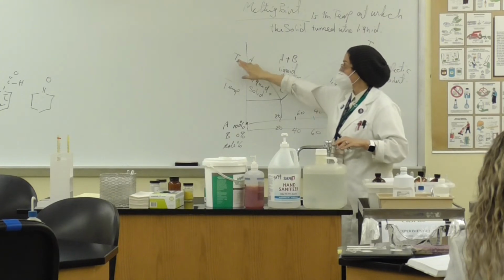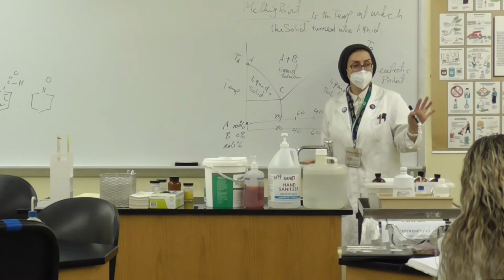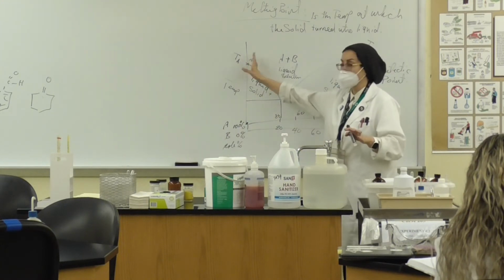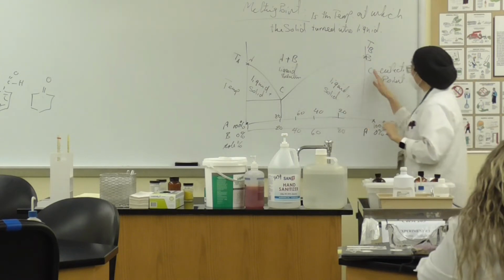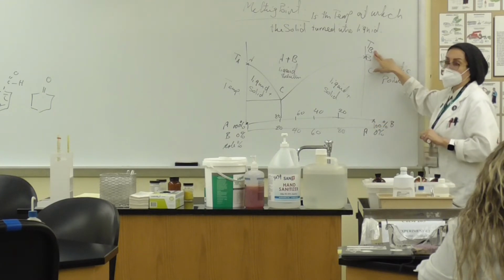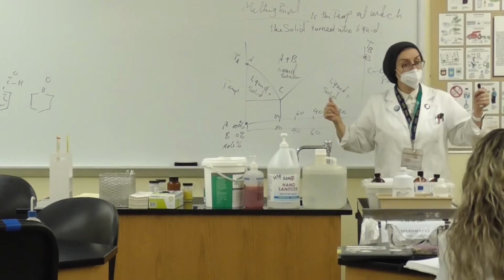You see, this is the temperature at A, which is 100% A. It's 100%. This is molar percent, okay? 100% of the A chemicals. Then we have the B chemicals at this point, like here. Also, it's very sharp, and the range is not going to be that long, okay?